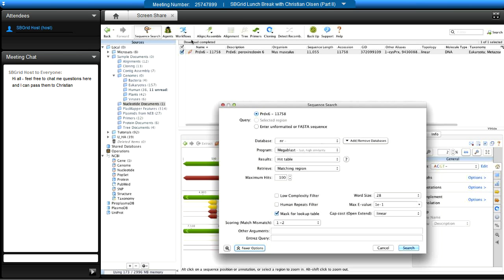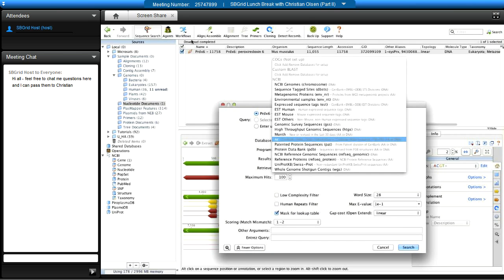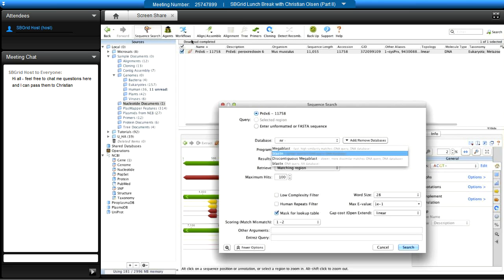Geneious prompts you with a dialog box — you'll see this type of dialog for any operation, whether Gibson assembly or NGS. Geneious infers the selected sequence is the one you want to search. You can also paste in unformatted FASTA sequence. You'll choose your database — here we select the NR database at GenBank — and the program, which will be BLASTN. You can set parameters like the low complexity filter, repeats filter, and maximum hits to return, here set to 100.